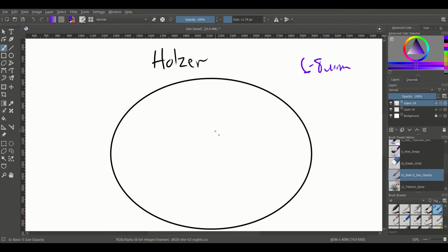But what that does do, as far as I can tell, the mechanics on this are a bit fuzzy, but as far as I can tell, the chloroform is going to allow our next reagent, which is our crystal violet, to infiltrate the glial fibers and everything else on the slide. So anything else that would take in crystal violet is also going to be kind of a deep blue to purple. And at this point, everything on the slide is just blue and purple.